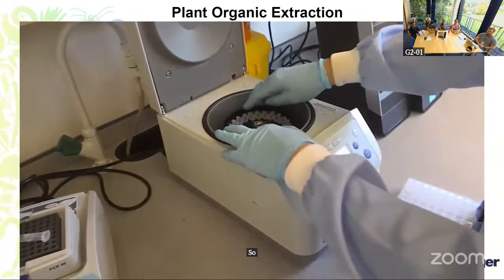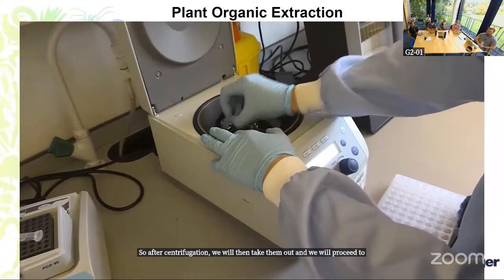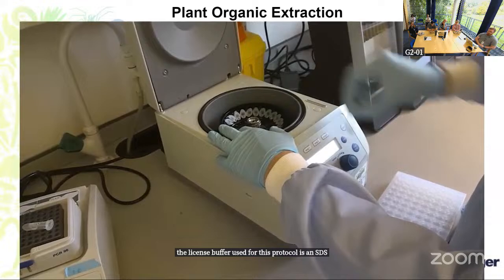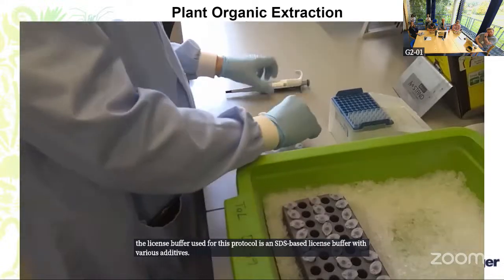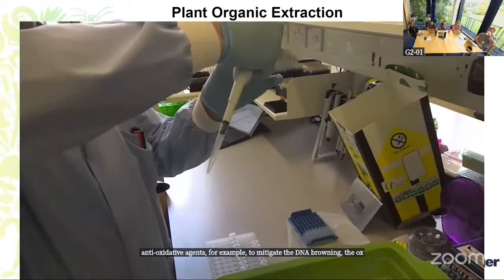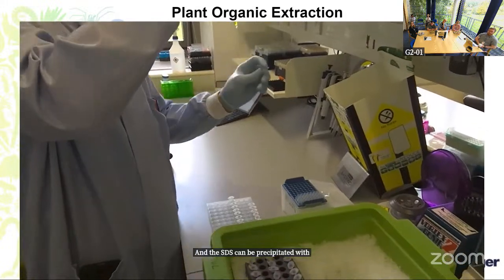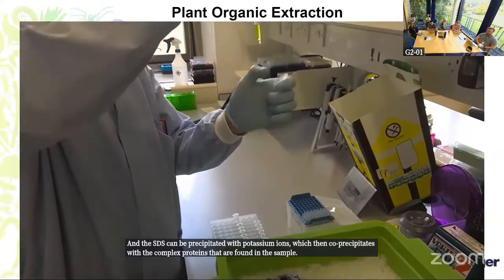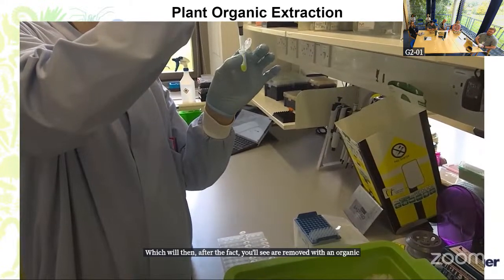After centrifugation, we will take them out and proceed to protein precipitation. The lysis buffer used for this protocol is an SDS-based lysis buffer with various additives, antioxidant agents, for example, to mitigate the DNA browning, the oxidative damage. The SDS can be precipitated with potassium ions, which then co-precipitates with the complex proteins found in the sample, which will then, as you'll see, be removed with a chloroform-based organic extraction.